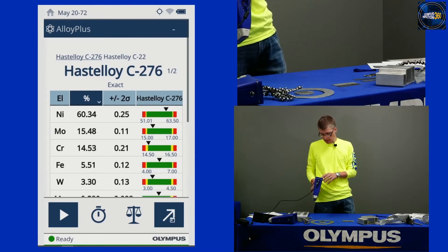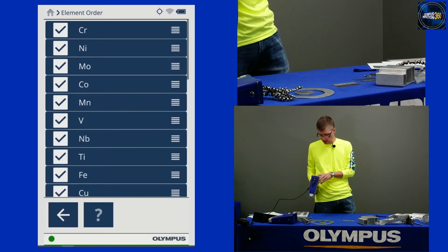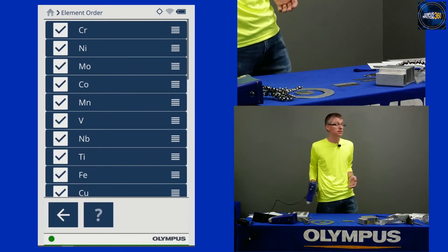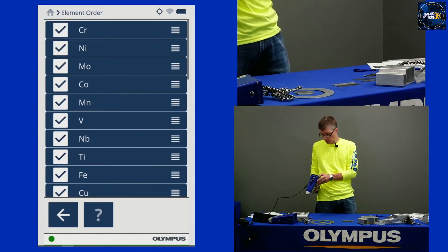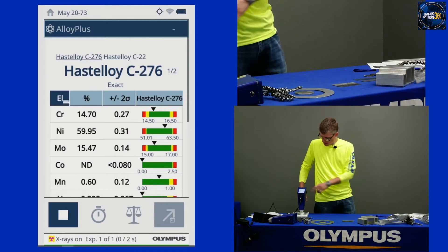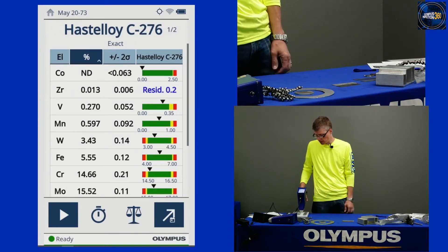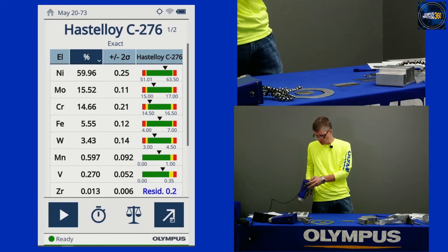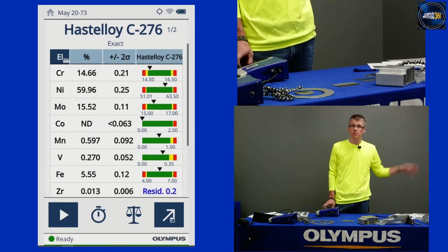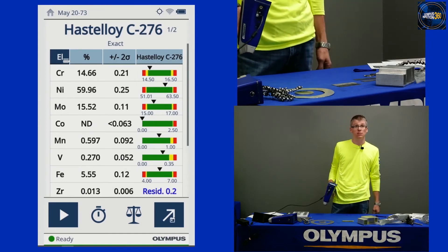Another thing I like to do to optimize my testing is change my element display. I can customize this just like a playlist — press and hold, drag elements around. I put chrome, nickel, moly, and cobalt — the most valuable elements — up at the top, because that's what I'm paying for and buying on. Shooting a Hastelloy here, you can see your chrome, nickel, and moly listed at the top — no cobalt in this Hastelloy. You can quickly change the display to sort by concentration just by touching, going from highest to lowest concentration, or keep that customized order. If all you're doing is sorting grades and throwing aluminums into barrels, just put the grade match at the top. But if you want to do fine sorting on chemistry, display the elements you're paying on.